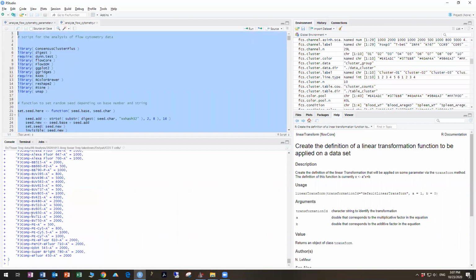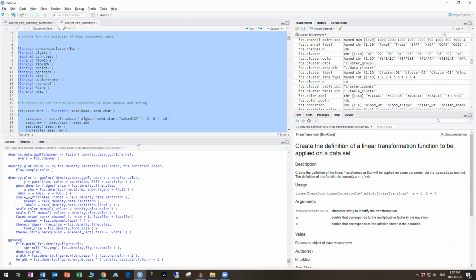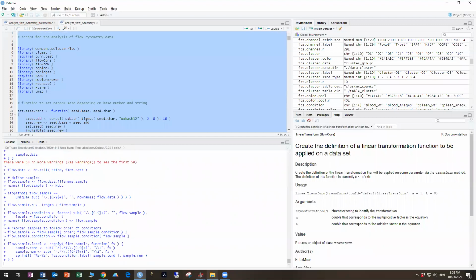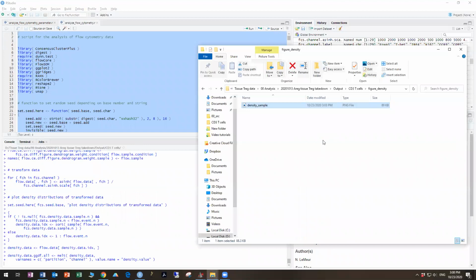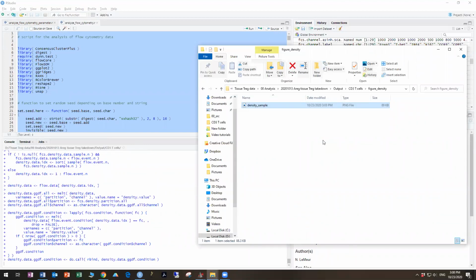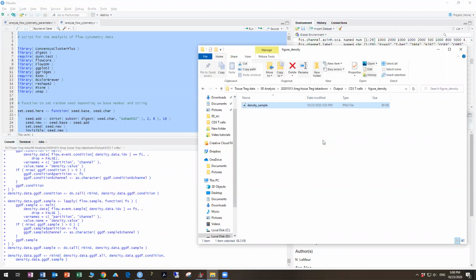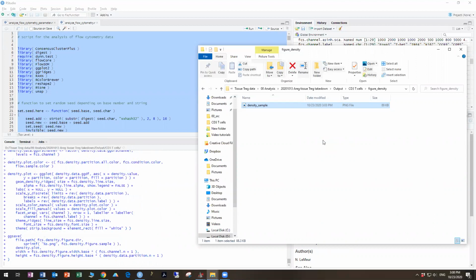and run this again. So to run something that you've just run again, for instance, a couple commands ago we ran the entire script up to this point, we just hit the up arrow. So the last thing I loaded in was the changes to the transforms, and then before that was the script. So by pressing the up arrow twice, I get to that, and now I just hit enter, and it runs that command again. So we will wait a third time for it to run the transforms, and once that's complete, we'll proceed with the rest of the analysis if we're satisfied with the output.